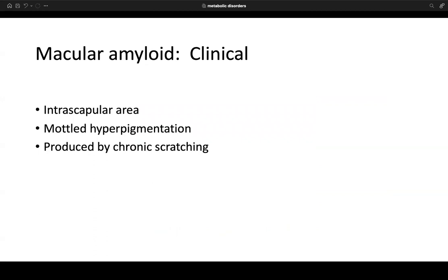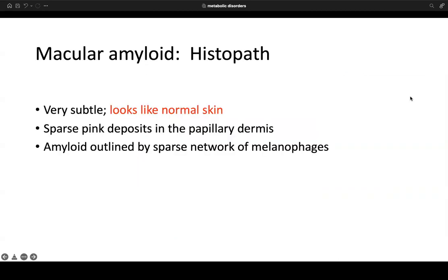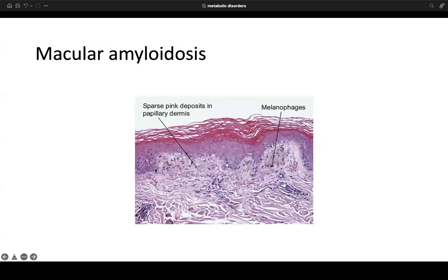Macular amyloid most commonly occurs in the interscapular area, appearing mottled with hyperpigmentation produced by chronic scratching. On biopsy it may look subtle from low power, even like normal skin. Going into the papillary dermis reveals sparse pink deposits with networks of melanophages stuffed in between the small spaces of those pink deposits.